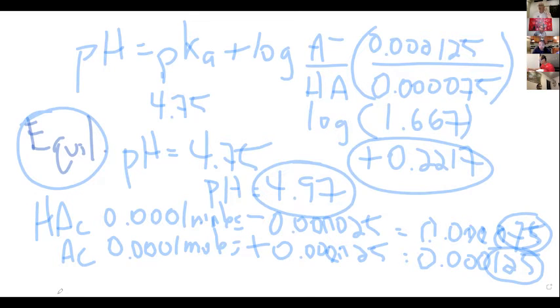And that makes sense because we have a buffered solution at 4.7. We have added some strong base. So the pH is going to go up a little bit. It's going to increase a little bit, but not by a lot. And so you can see it went from about 4.8 to about 5.0, which is about right. I mean, it went up a little bit, but not so much that we would be able to tell the difference. Because if you remember, if you looked at your plate, the color really shouldn't have changed from 4.8 to 5.0. That universal indicator is not going to be able to tell the difference. It needs to change by like a whole unit or so in order to change the color. So going up by like 0.2 units isn't really enough to change the color. And so that makes sense.